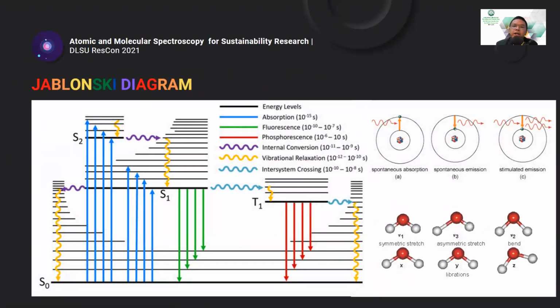So we have here a diagram showing some electronic transitions or energy transitions. So the typical transition that we may be familiar with is the absorption phenomena, wherein once an atom absorbs a specific wavelength, then an electron from the ground state may jump to the excited state, and the energy released will be utilized by a specific instrument for a particular analysis, which may be qualitative or quantitative. Now, absorption may happen if the atom or the material requires incident light or external radiation.